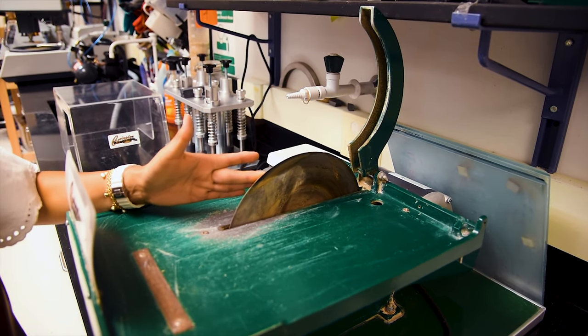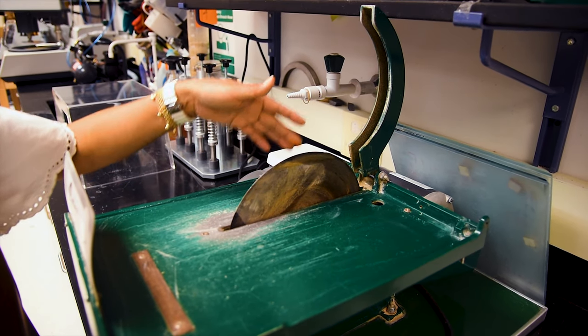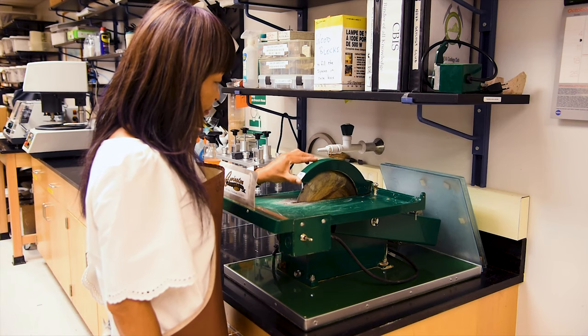An adjustable guard over the top of the saw blade suppresses the amount of spray and keeps the water concentrated on the blade and the sample.